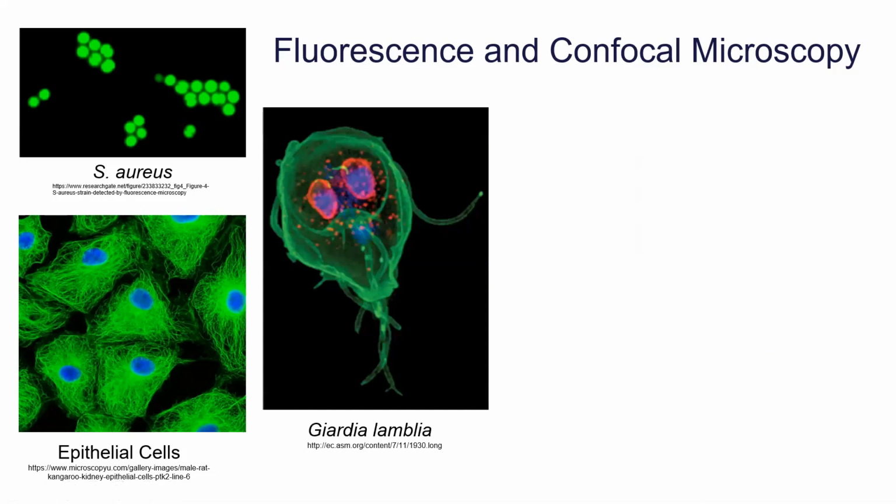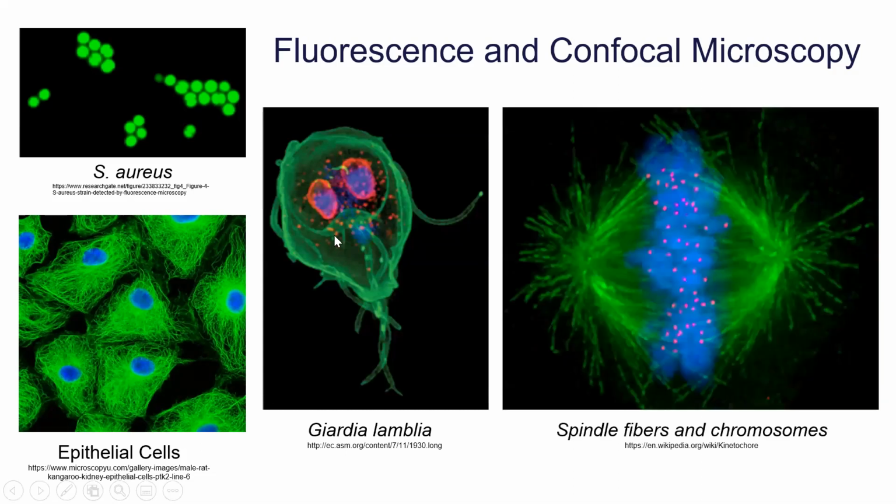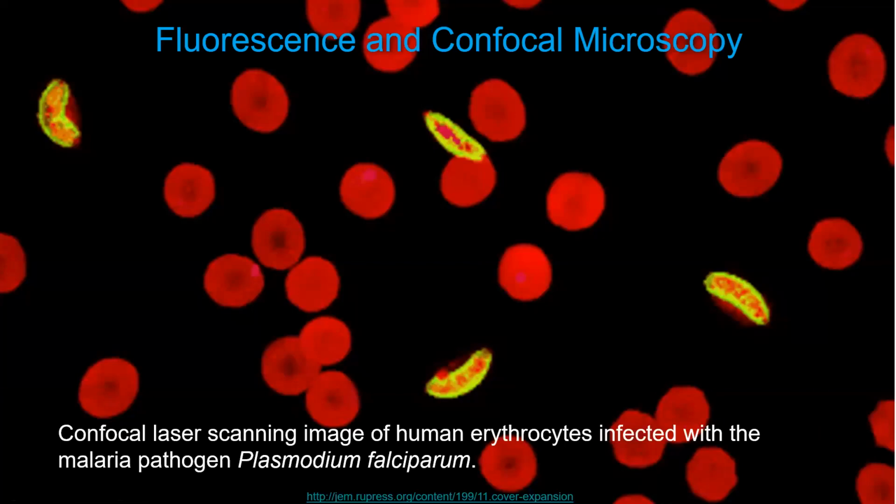There's our Giardia again, still looking like a little bit of an alien. And there's some spindle fibers and chromosomes, and they're at metaphase, and they're getting ready to separate and do their thing during mitosis. I'll show you more pictures. I have lots of images to show you.